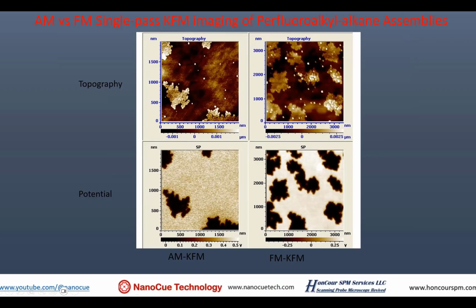Basically, because it's caused by the dipole moment, you have a mirror charge that was canceling it out in one case. In the other case, you've got some thick mica sample on a steel puck behind it, and it doesn't cancel it out in terms of the field that the tip is seeing nearing this top surface.